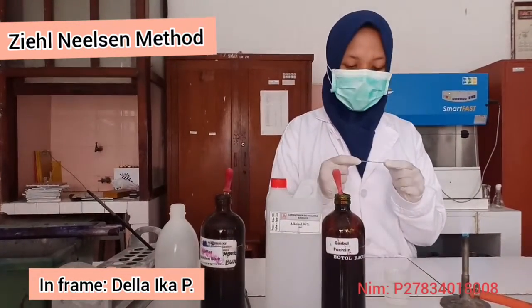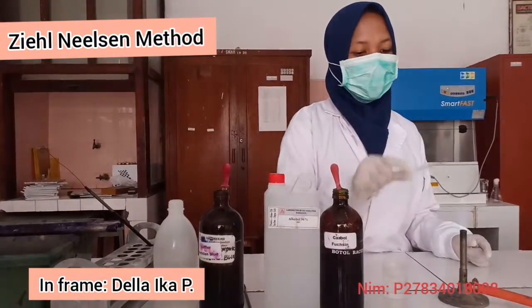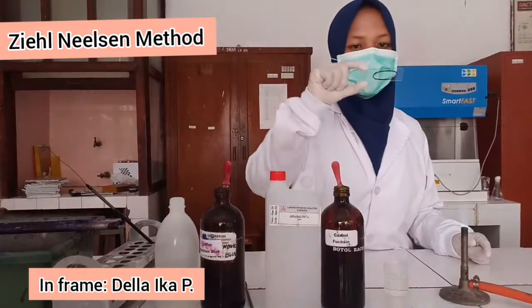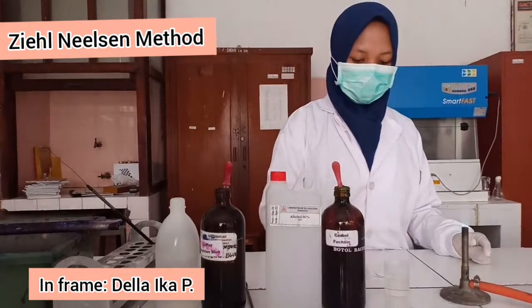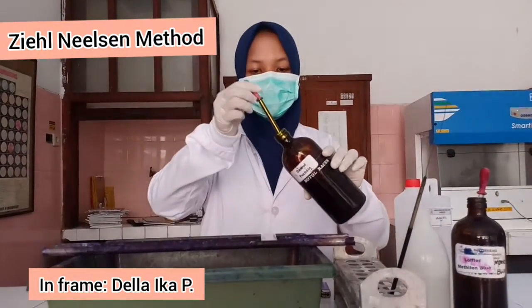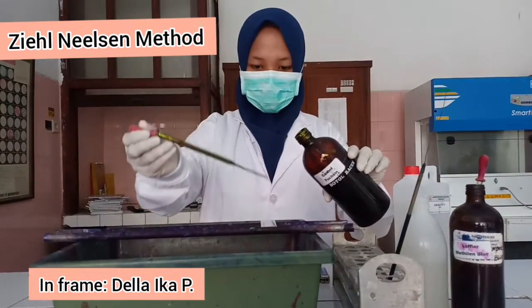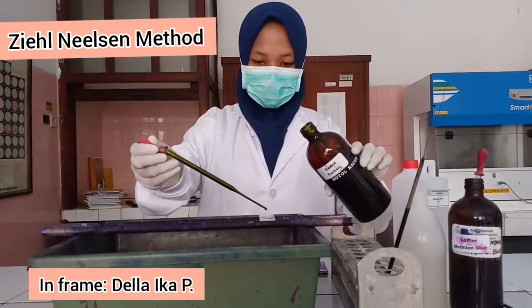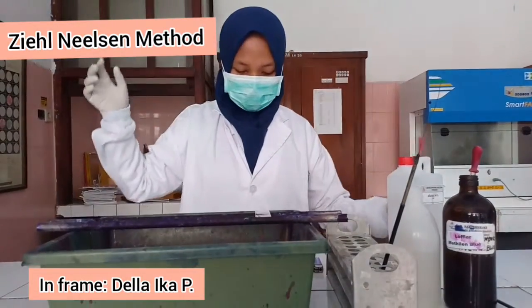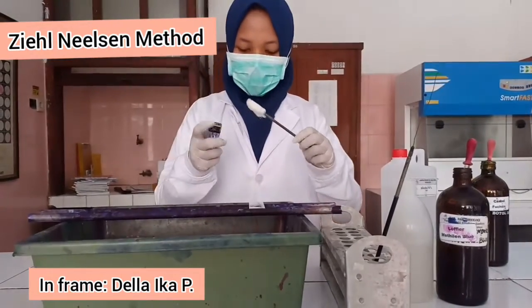After that, fixate the preparation again over the Bunsen burner to glue the bacteria to the object glass and to kill the bacteria. Apply carbolfuchsin to saturate the object glass, and heat for 5 minutes.